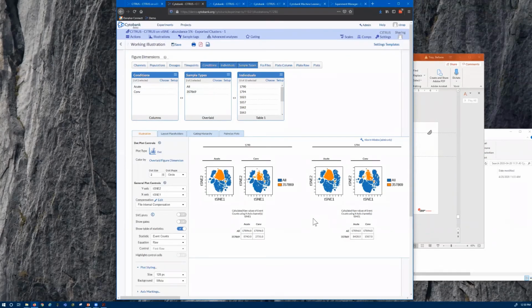Okay, thank you. Chi-Hao, could you answer this one? How would one statistically adjust for unequal group sizes? Yes.